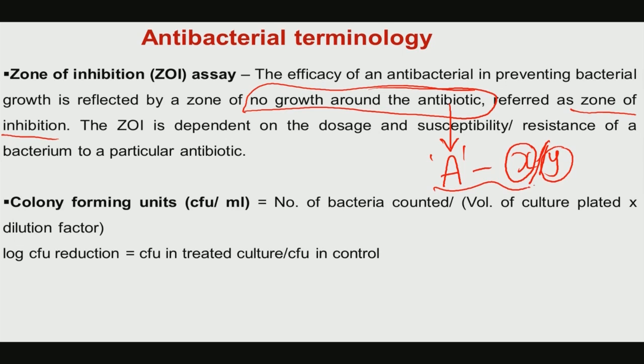Now, in the context of an antibacterial material, let us say hydroxyapatite, and I have given this example multiple times, X% silver composites. Instead of an antibiotic, you are interested in what value of X% silver will give you a similar description for the MIC, MBC or ZOI.